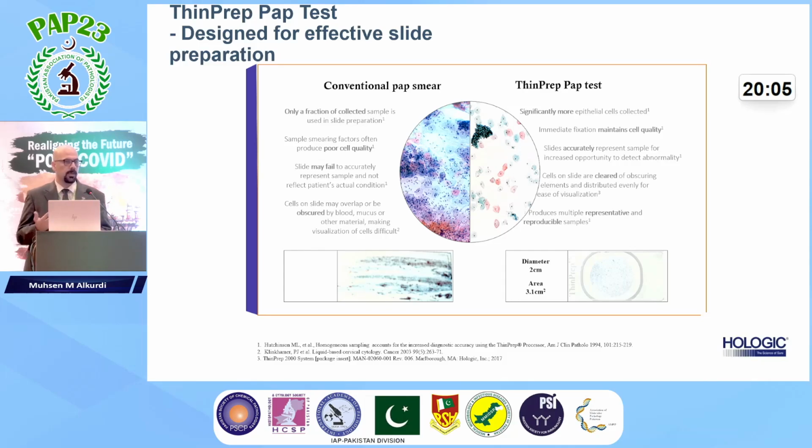I won't say much on this slide. I think the comparison is very clear from an eye perspective. Whoever has the opportunity to work on liquid-based cytology will really feel the difference and how much it saves in effort and turnaround time for the pathologist, and way less effort producing the cell spot.